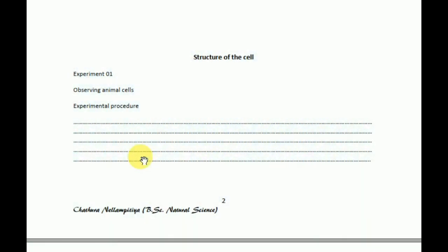Hope you got the idea of how to prepare a specimen as well as observe it in low power. So in this space, you can practice this and write the main steps, nearly 5 steps. First step I will recall again. First thing we are going to say, take a small sample of living cells. For example, we took animal cells from our cheek cells, because we are also animals actually. So we take some cells from the cheek epithelial surface using a toothpick.